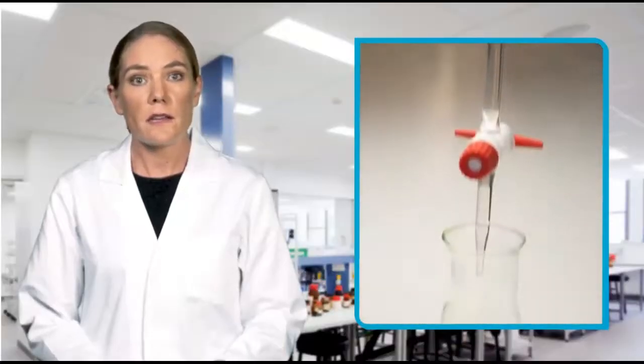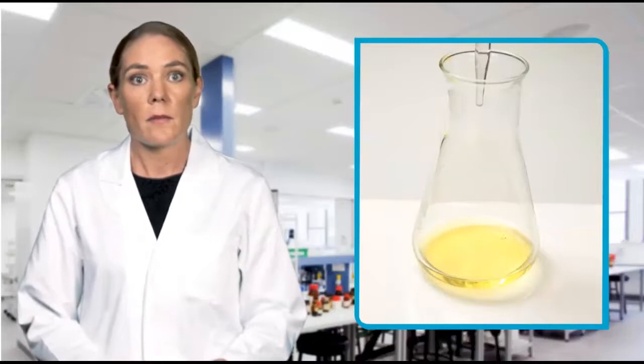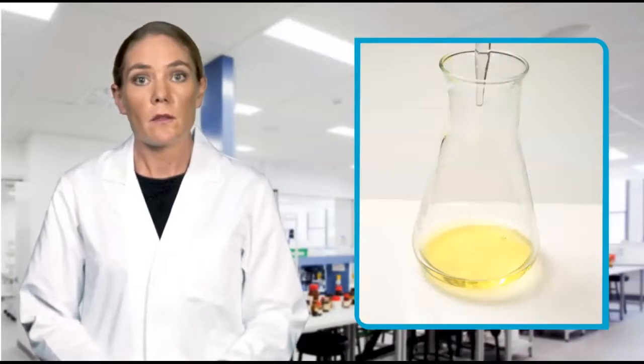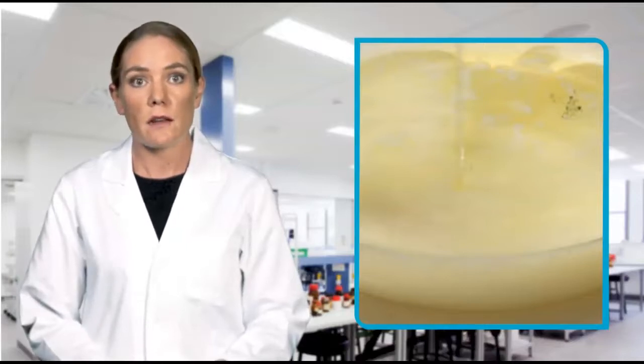When it is added to the water sample containing the chloride ions, it is a pale yellow colour. Silver nitrate is added from the burette to the conical flask containing the chloride ions and the indicator. The conical flask is placed on a white tile so that the colour change can be easily observed. Whilst the reaction between silver ions and chloride ions is taking place, the potassium chromate does not change colour.